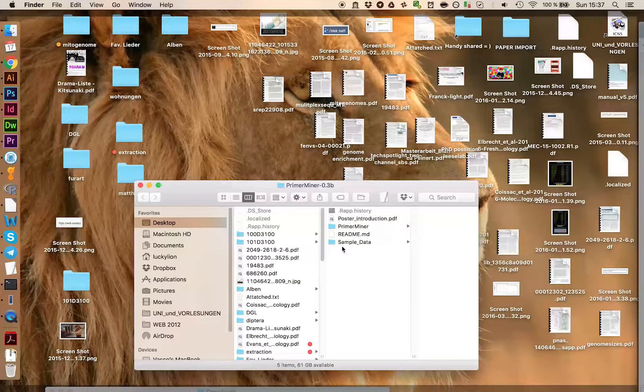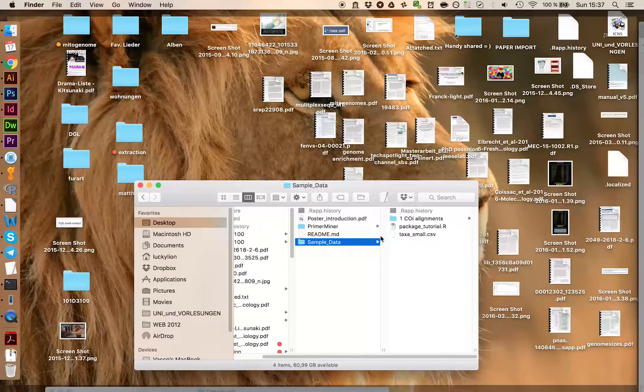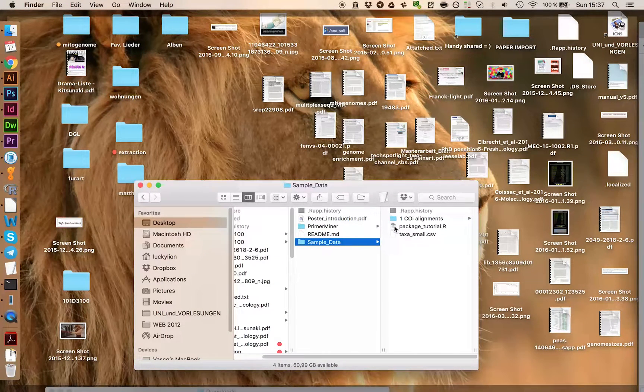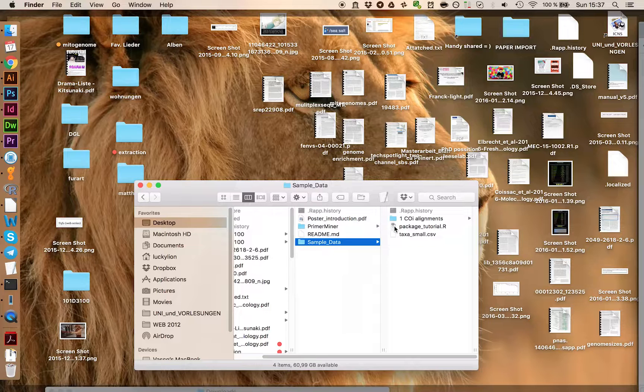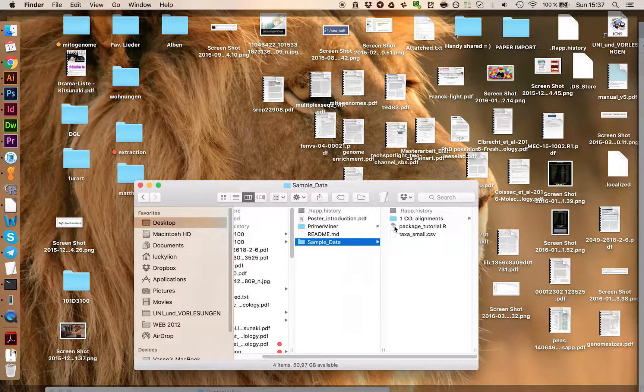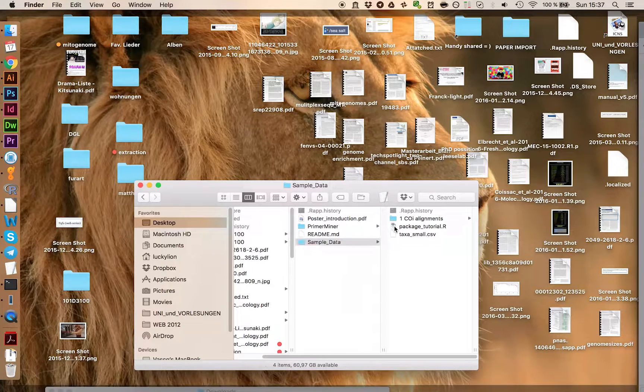Open the folder and go on sample data. Here you find the package tutorial which also includes the scripts to install PrimerMiner.